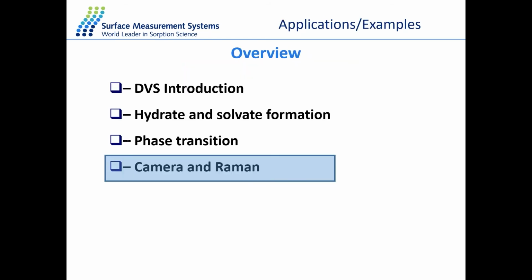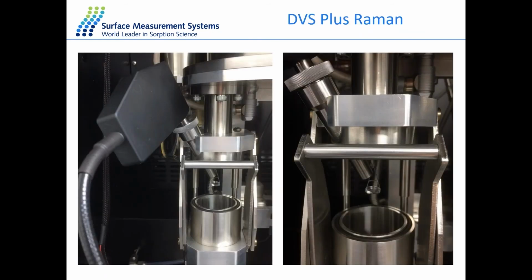The last part of my presentation will be dedicated to an application with camera and Raman. Specifically, I want to introduce how we perform this experiment on the camera and Raman. I'm going to show you a brief example of a study of hydrate and solvate formation.